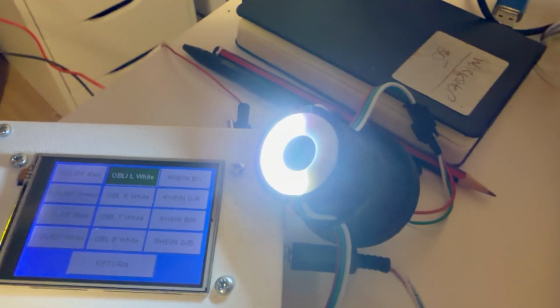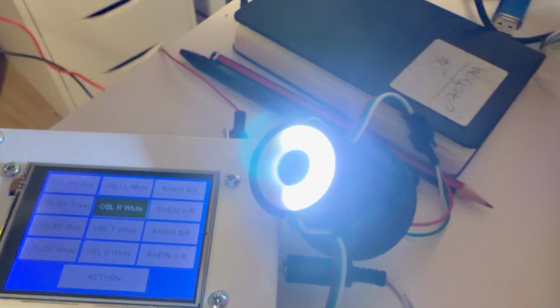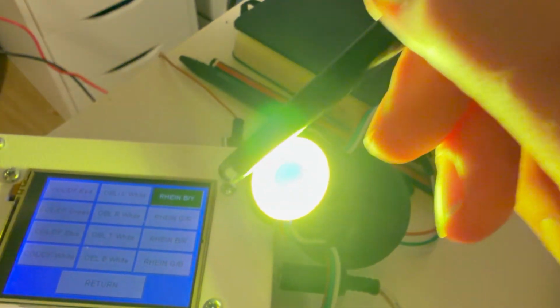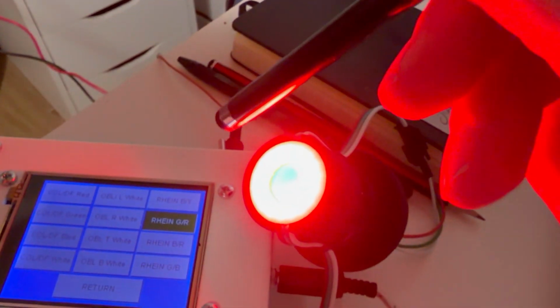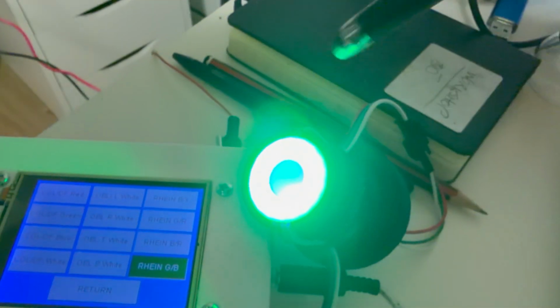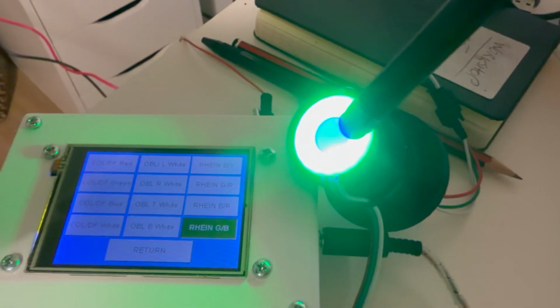So here, this is oblique left. This is oblique right, this is oblique up, this is oblique down, Rheinberg yellow-blue, Rheinberg red-green, Rheinberg red-blue, Rheinberg green-blue. Okay, so that's basically it.